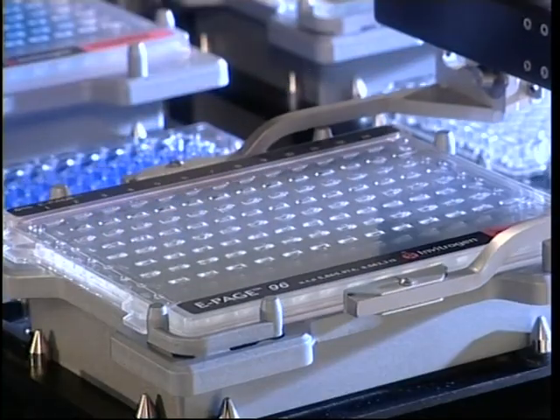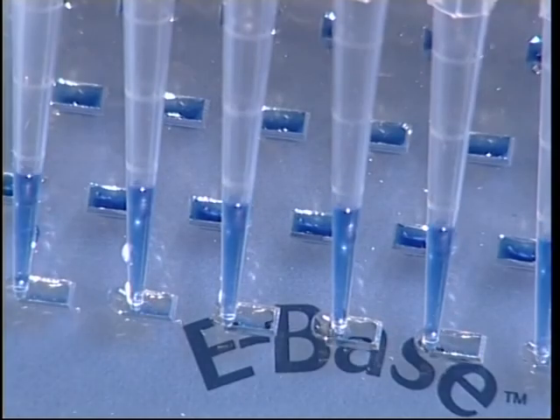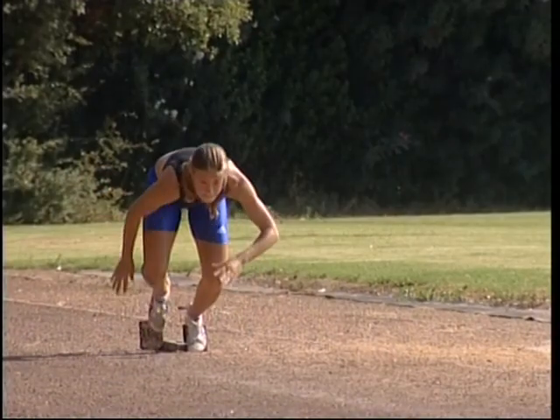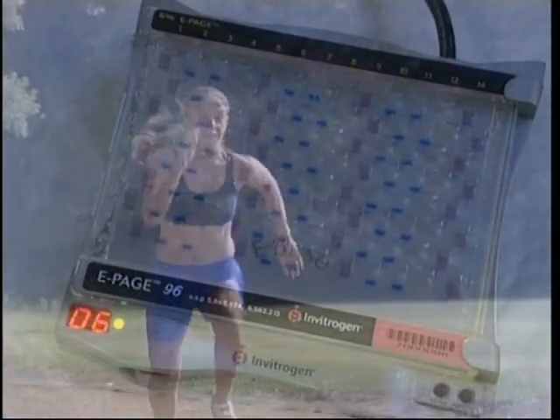Come and meet ePage, the new fast and dry protein analysis system from Invitrogen. ePage brings speed, accuracy and ease of use to protein electrophoresis.